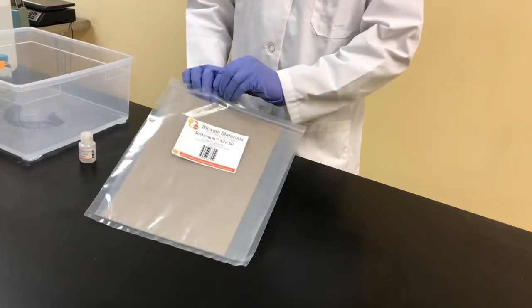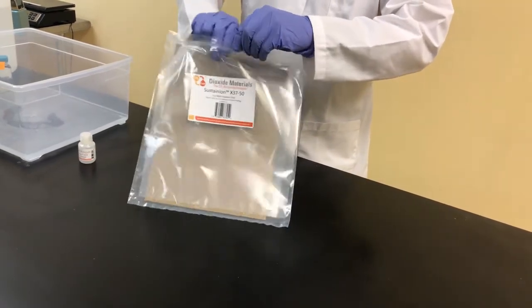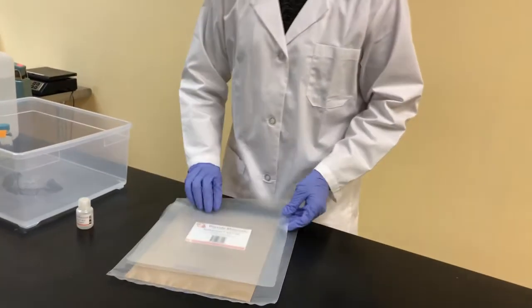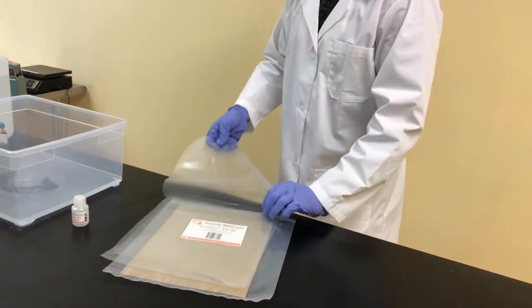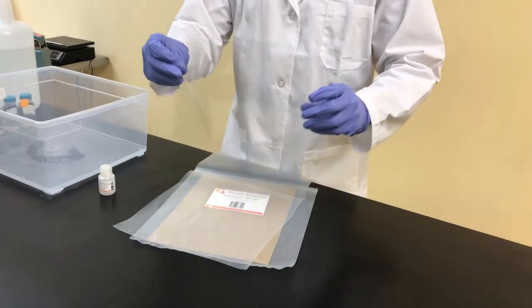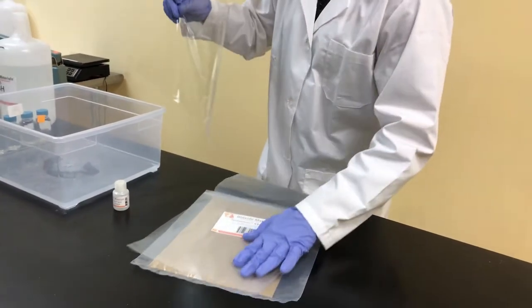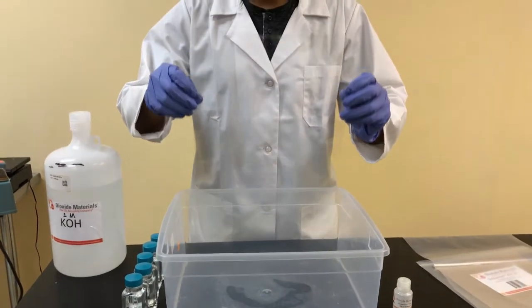As you see here, we're getting ready to open our package. It contains the membrane that was shipped to you. We're simply going to remove the membrane — it's attached to the liner. We're going to place the membrane face down in a horizontal bath here. The membrane is going to be face down.